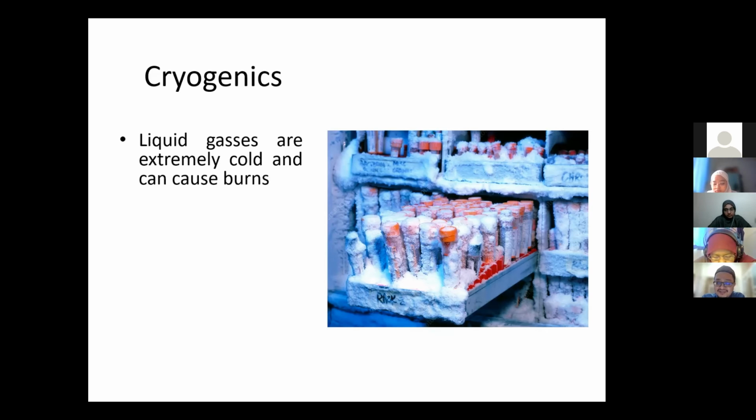Pernah tengok ke -80 freezer? Pernah? -80, bukan freezer dekat rumah. Freezer ni -80. Itu hari masa COVID-19 vaksin tu dia nak bawa ke Malaysia yang Pfizer tu kan jadi isu sebab dia kena masuk dalam -80 container. So very low temperature. Okay. Sebab dia nak preserve some of the materials.